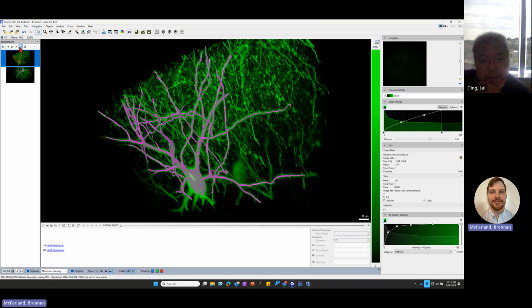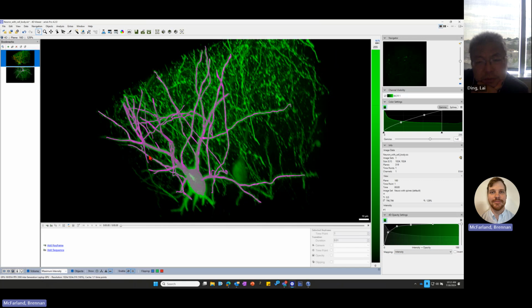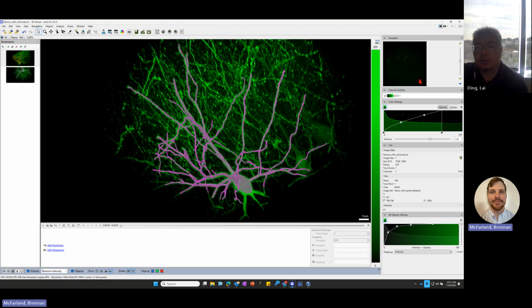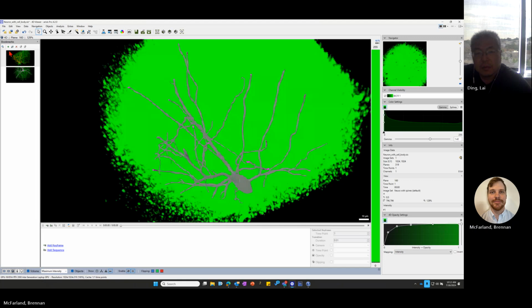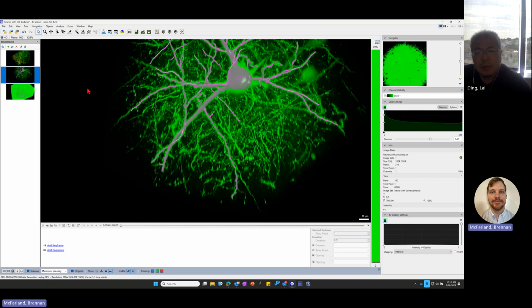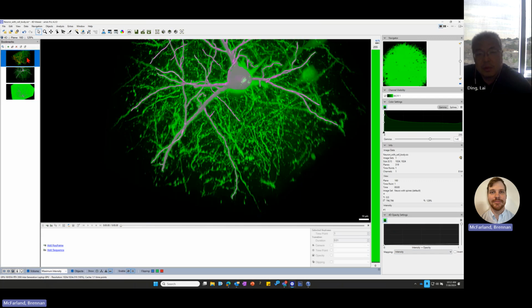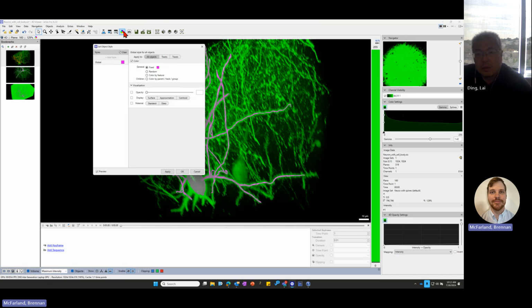And then go and click them. The colors will not transfer over. So you can see it's going to keep the same perspective, and it's going to keep the intensity information that we have set. So if I lowered this right here and I click that, it will retain that information. But then if I go back and click this, you can see now it's super saturated. So that information will be retained, but the coloring of the objects will be set to however you choose to display them within here. Okay.